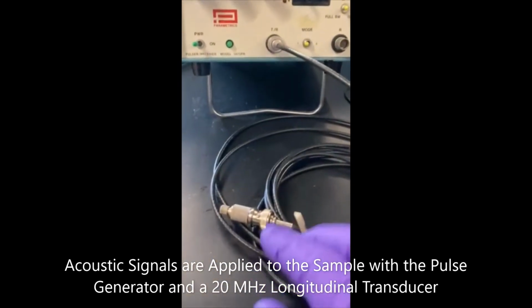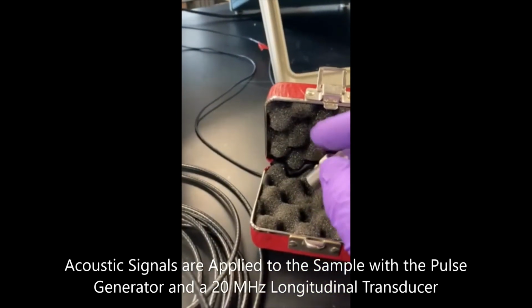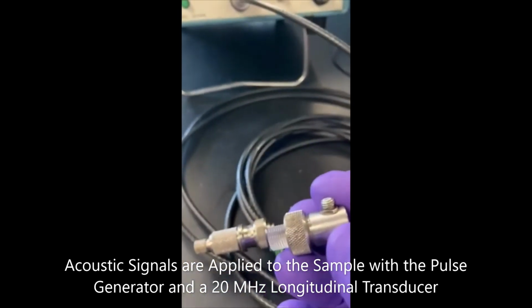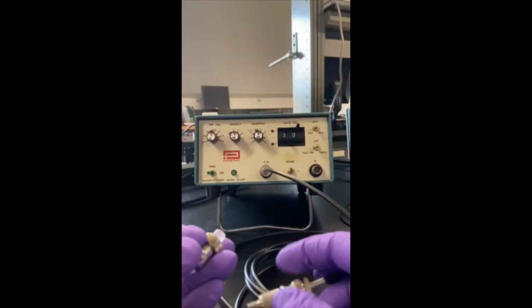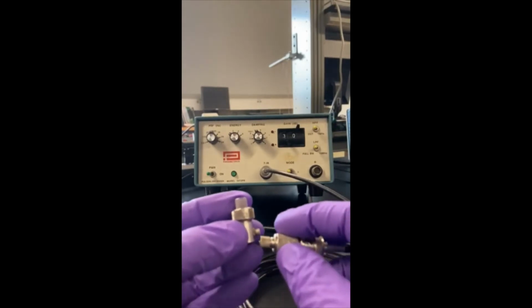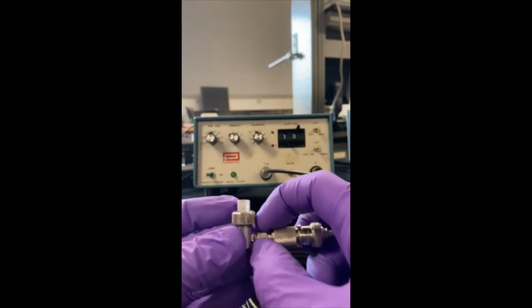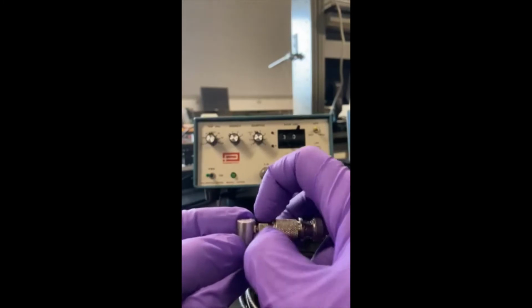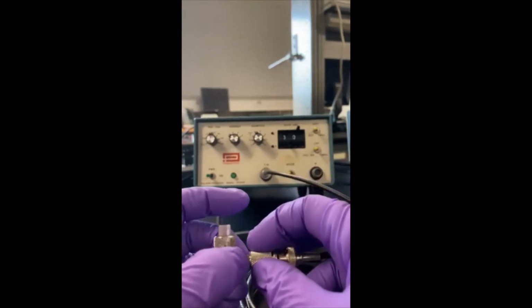This is the Panametrics pulsing unit. Here we show you the end of the connector and the transducer. The transducer is a piezoelectric crystal, which when you apply an electrical bias across the crystal will change dimensions. By changing that bias at very high frequency, you can make the crystal oscillate in shape, extending and returning. Basically, turn the transducer into a high-frequency tapping instrument.